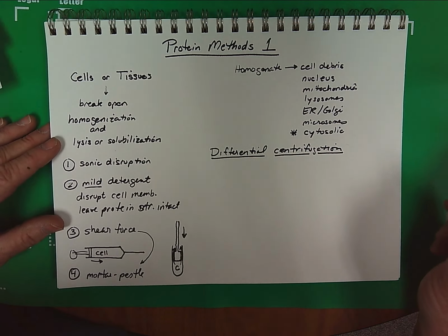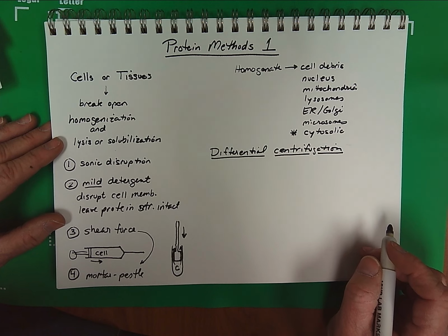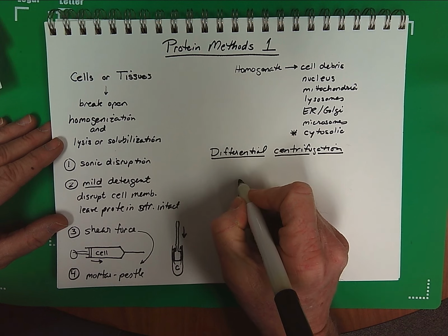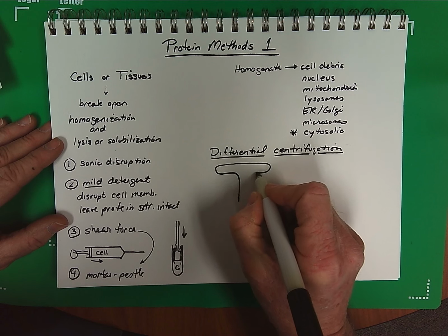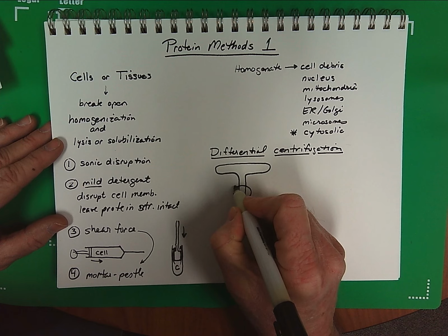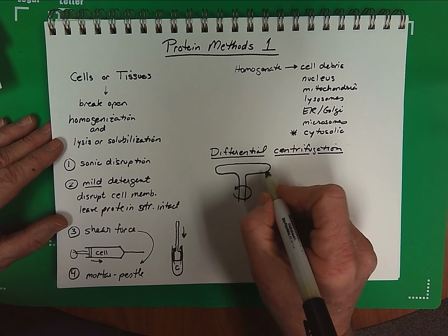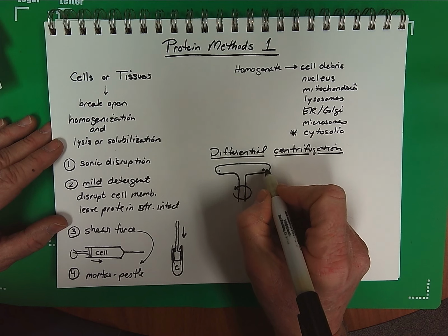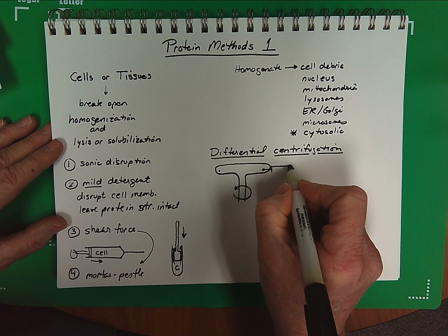Now, centrifugation is a very simple principle, although the equipment is very sophisticated. We will typically have, for example, a rotor that fits into a centrifuge, spins around the central axis, and we have what are called swinging buckets that are attached to the ends of the rotor. And so what these do is support test tubes.